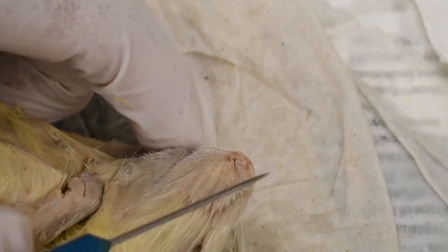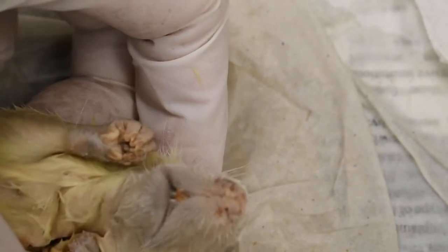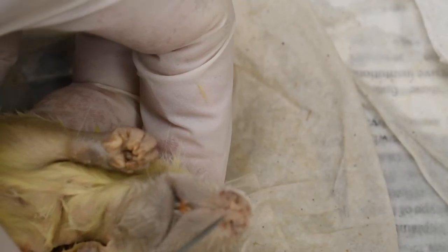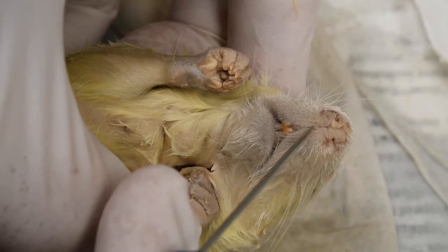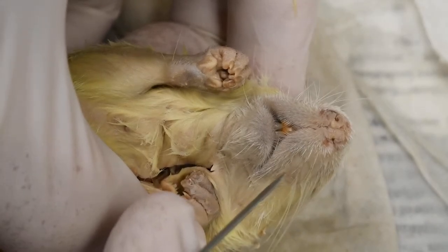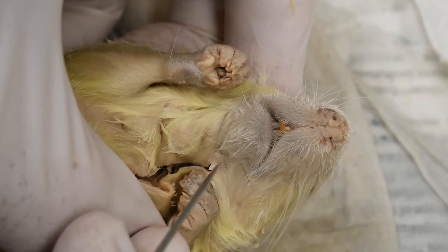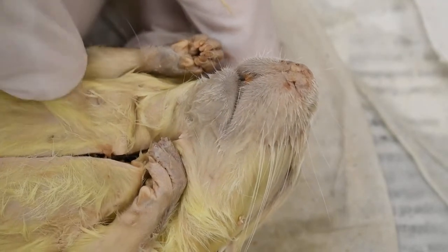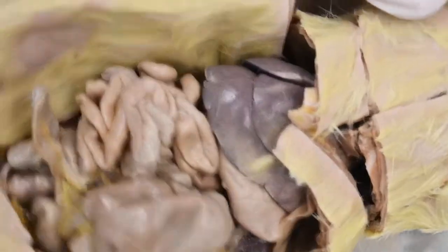These little hairs here are called the vibrissae. And here you can see the external nares. This line is called a philtrum. And there you can see the incisor teeth. That's about all we're going to really say about the head. So the rest of the time we're going to focus mainly on the abdominal cavity.